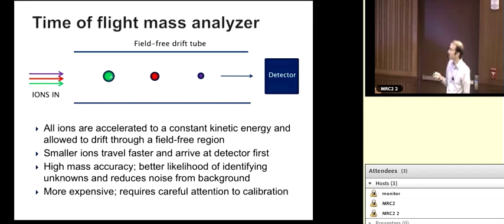Some things that can cause ion suppression, as I mentioned, non-volatile buffers or salts, PBS rinses. That's super routine and very gentle in the context of biology, but it may not be the best thing to do if you're preparing to submit a sample where you're going to do trace level analysis for metabolomics. And so we can tell you some things about volatile buffers to use if you need to do a buffer rinse immediately prior to metabolomics analysis that can reduce that effect.